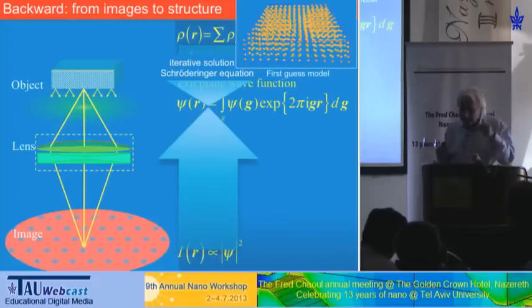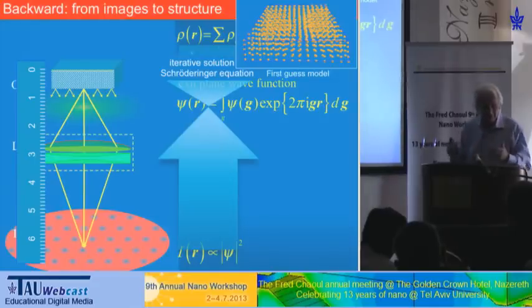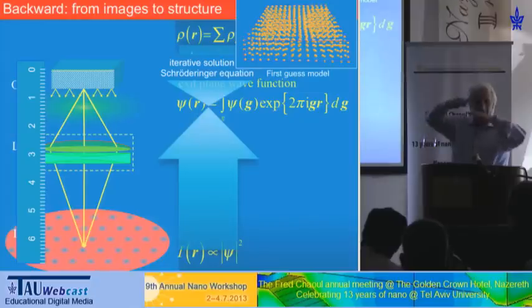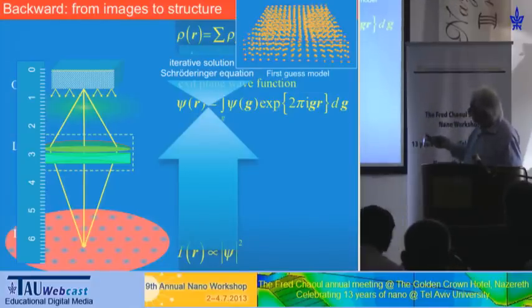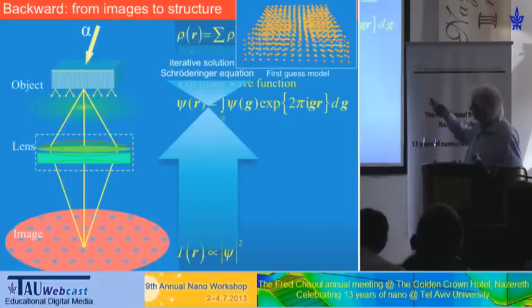But in quantum mechanical dimensions, you cannot measure the thickness of your sample. So a priori, the thickness of your sample is not known. So it can only be found by a scattering experiment. And the scattering experiment is your imaging process itself. So we have to take the thickness of the sample as a free parameter in this fitting process.